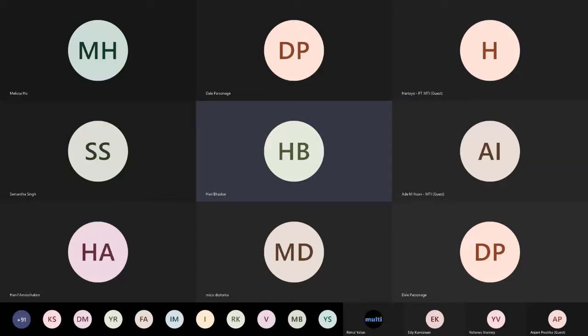The only thing that might take time is, depending on the number of calibration samples, the measurement time of the samples. So if you are going to have 50 samples in the calibration, then it will just take that long to measure the samples. But the setup itself is very simple and quick, and the software is quite intuitive as well.